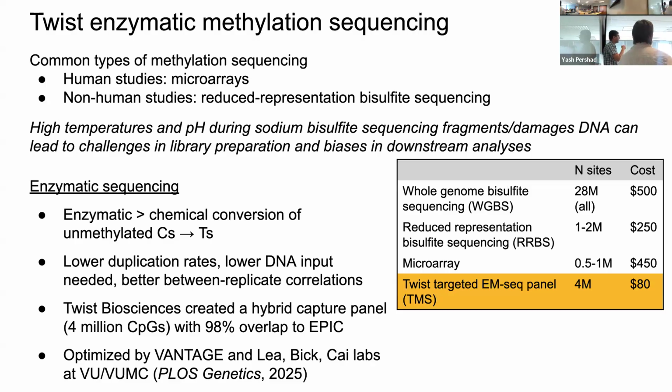I guess replication probes make sense if you're doing something similar to a genotyping array. If you're doing probes, you want to make sure that it works correctly. But since you're sequencing, the depth of coverage is kind of like a replication approach. You've spray painted the genome. If it's protected from spray paint, it's methylated. If it's not, then it isn't. You can just see how many reads support it being methylated. I think it's a difference in how the methylation is being ascertained.